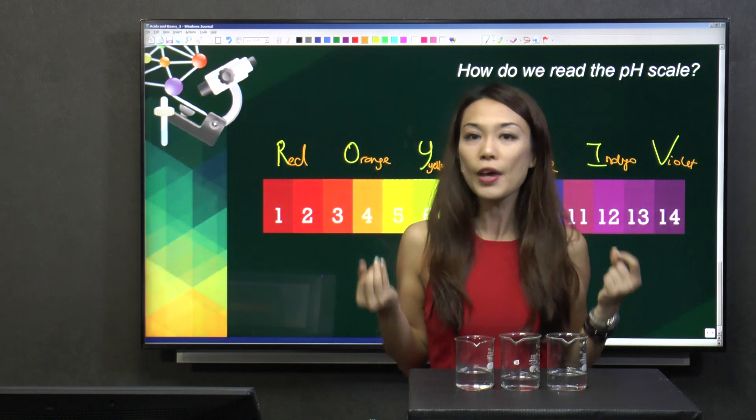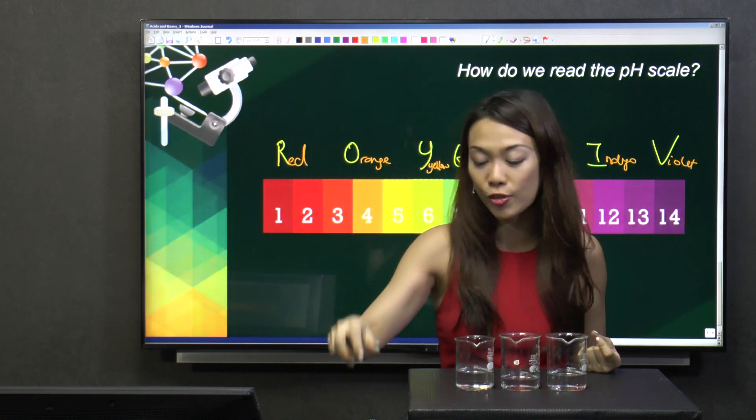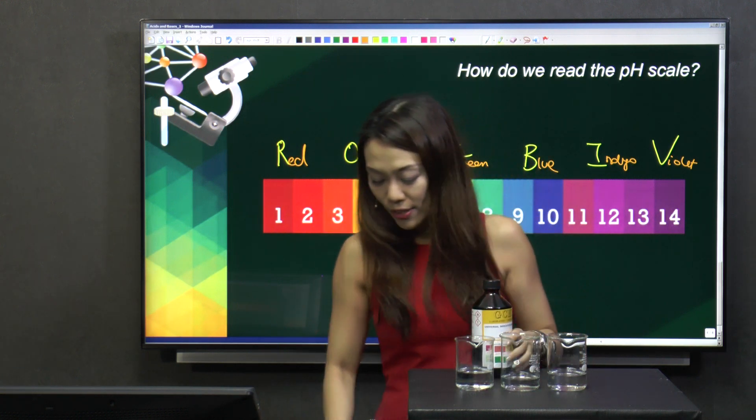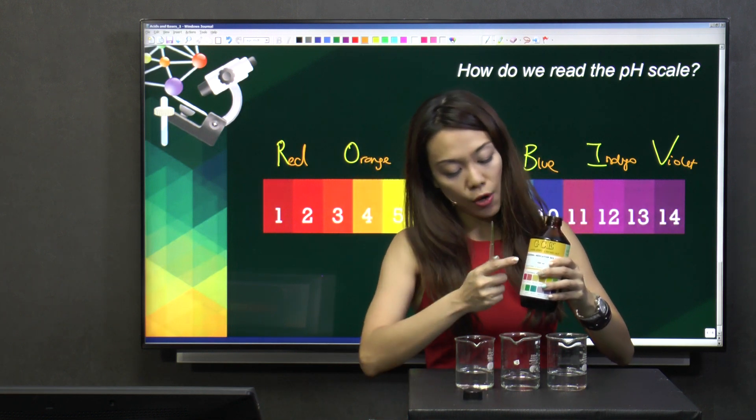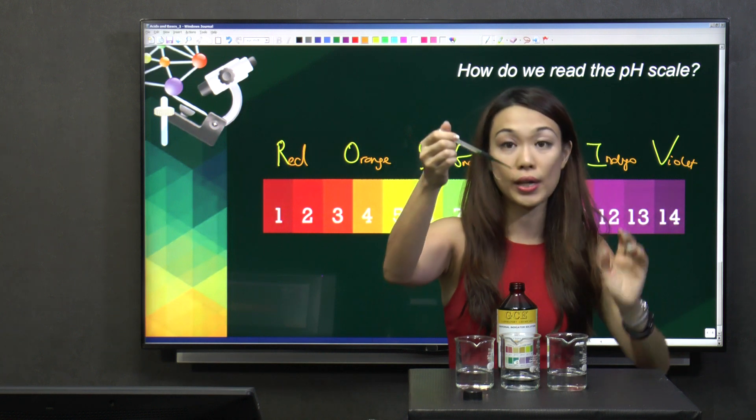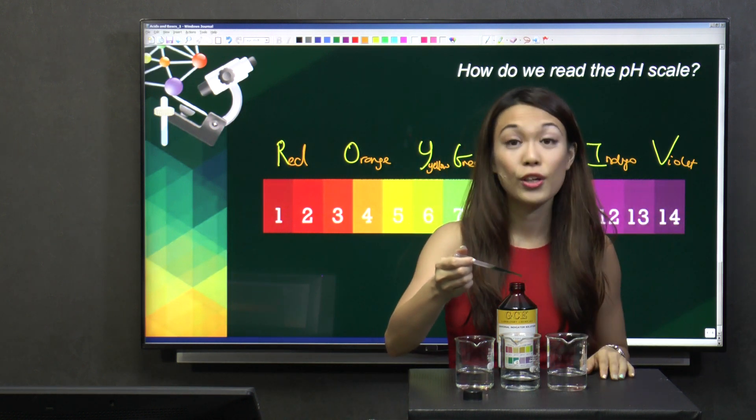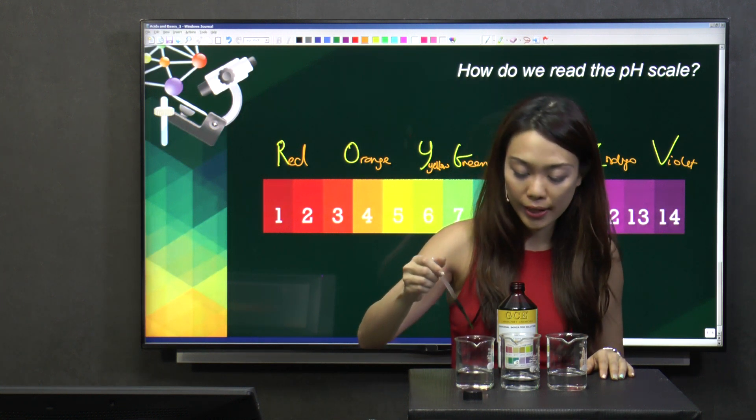So, as a good, faithful chemistry student, you must use what? I just taught you. You need to use universal indicator. So, I have universal indicator over here. If you take out, you can see that it's green in colour. As I mentioned, pH, what is green? Neutral, right? So, let's drop one by one and see what colour we'll get.